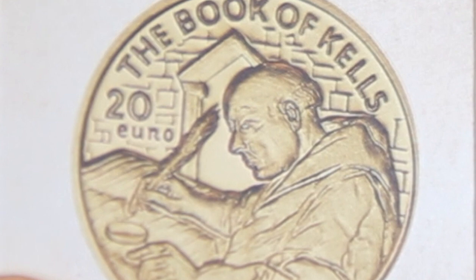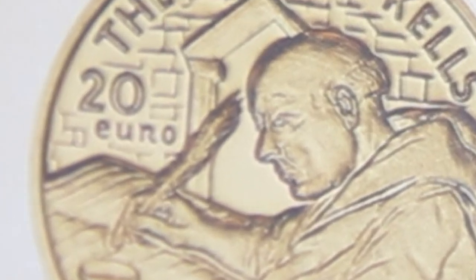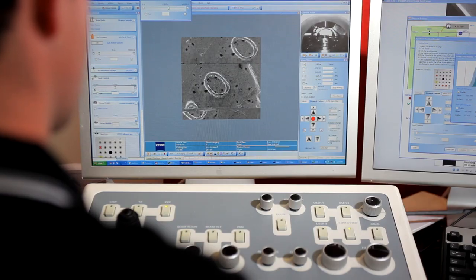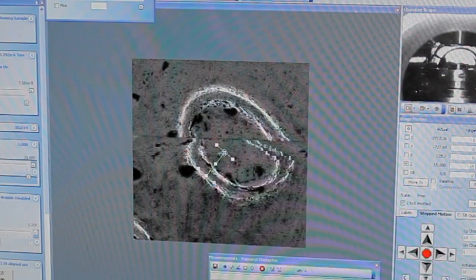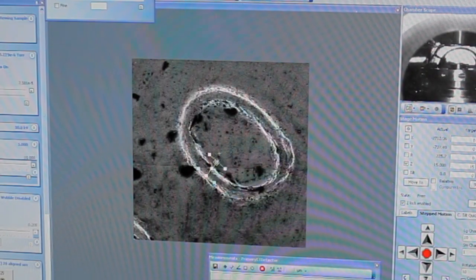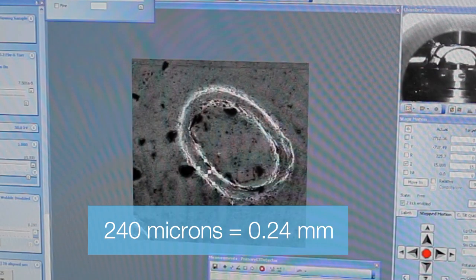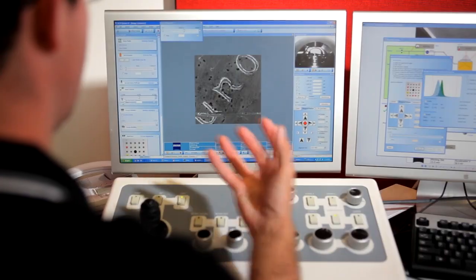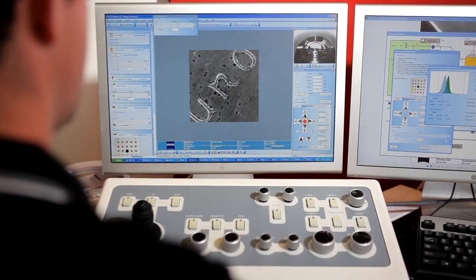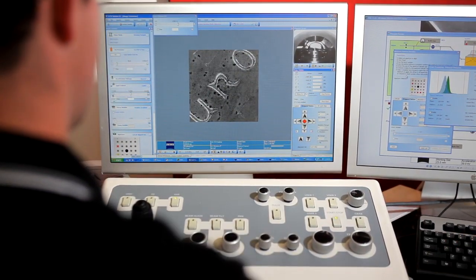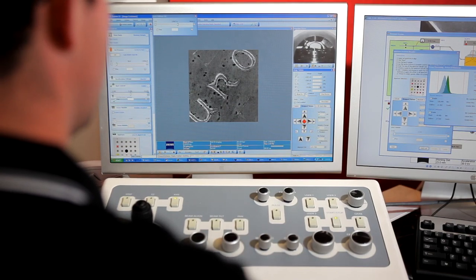The pattern will be etched within the O of the word Euro on the coin. So we're looking at an image of the coin. The O itself is about 230, 240 microns wide. So at the moment we're out at a scale that you can visualise with your eye.